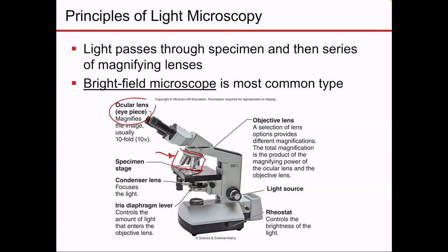This picture here shows a typical compound microscope. So you're already familiar with this type of equipment, but you have discussed this in previous bio class. So let's revise the parts and their function.